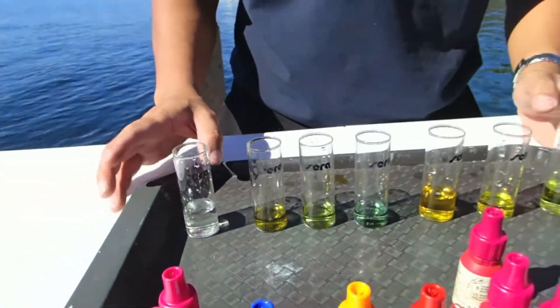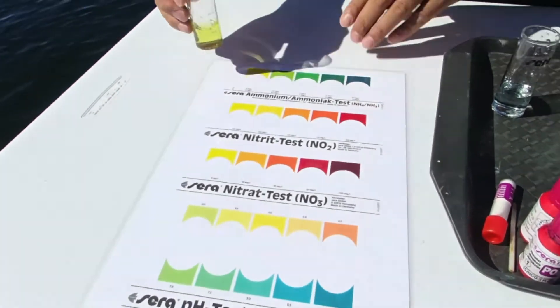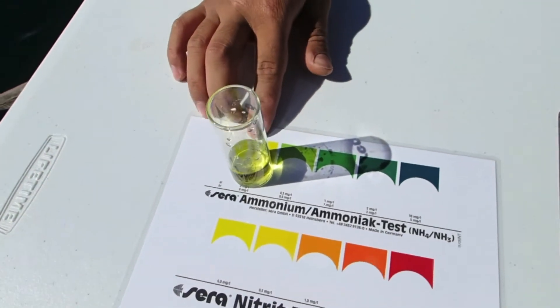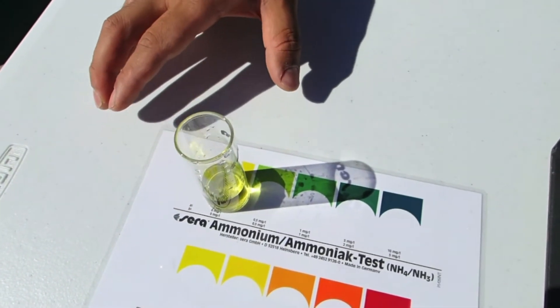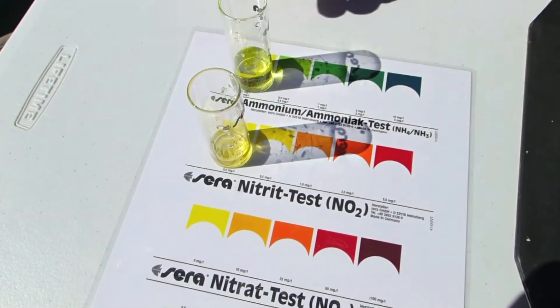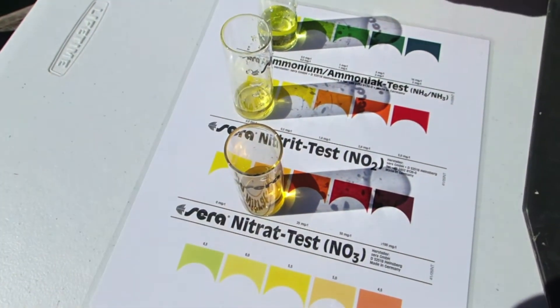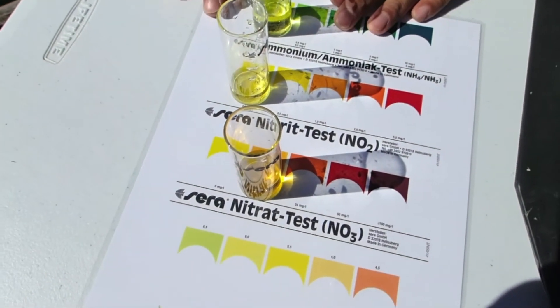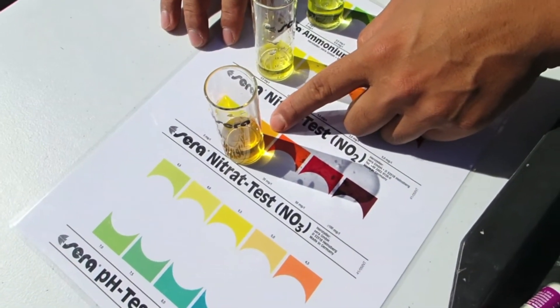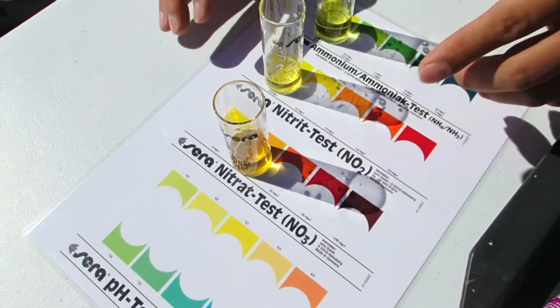So now that we've allowed enough time for the chemical reactions to occur, we can compare the test solutions to the chart. You can see they've got curves, so you actually look from above. You can see the ammonia is zero, which means that the biofilter is converting your fish waste away from ammonia. And if we have a look at the nitrite as well, you can see that the biofilter is working properly. And if we have a look at the nitrate, you can see it's actually at 10 milligrams per liter, so that means the fish waste is being converted to nitrate.